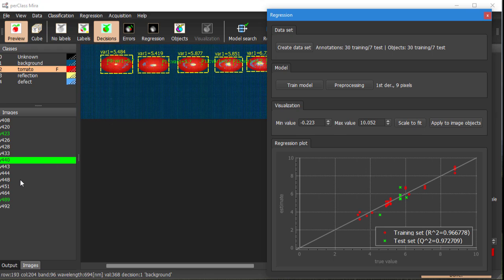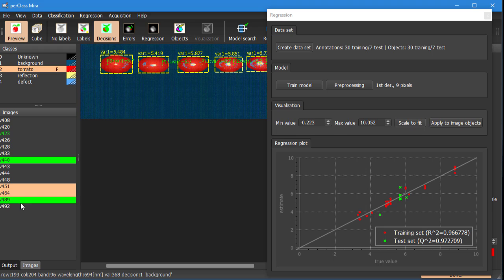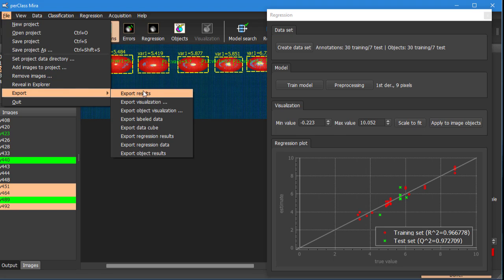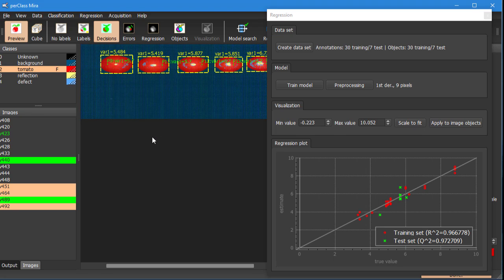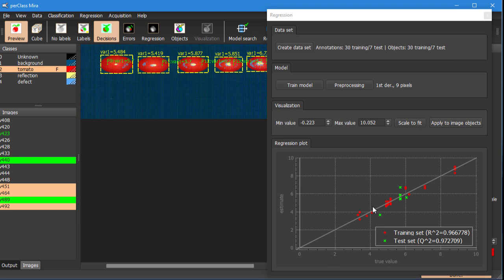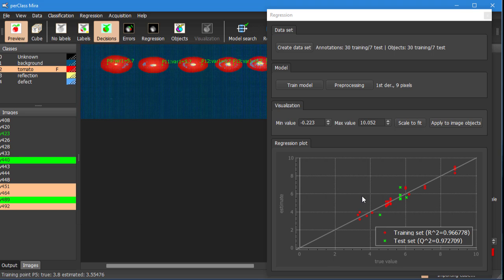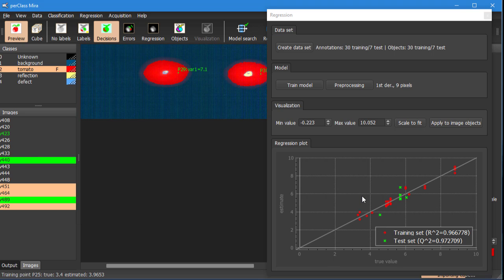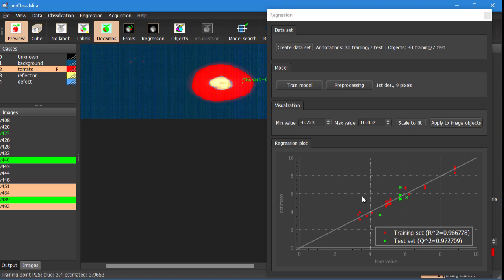For larger studies we are often interested in batch processing the data and then summarizing the results for example in Excel table. You can do that by exporting regression results for a set of selected scans. Per class Mira will then batch process these selected scans.